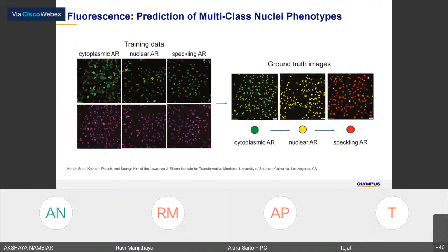But what this customer did is they had three different types of cells, where one sample only has class 1 cells, another sample only has class 2, and this one only has class 3, and they gave where the nuclei or objects are as a ground truth like this.